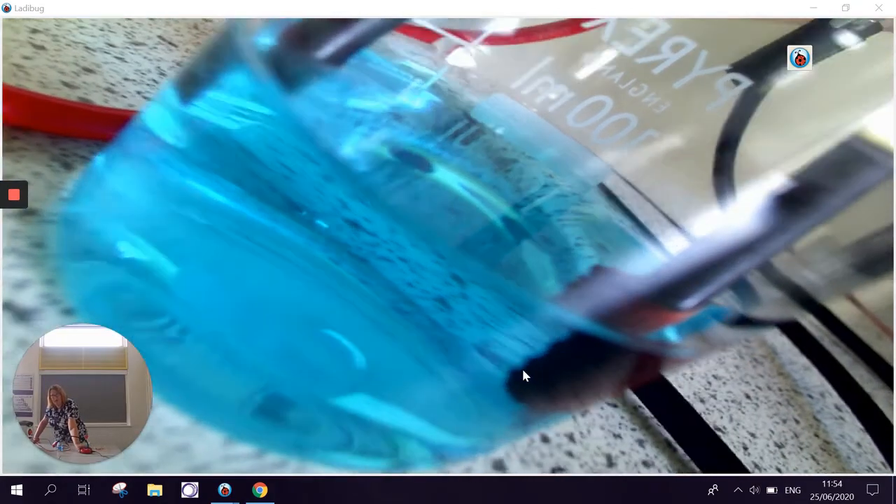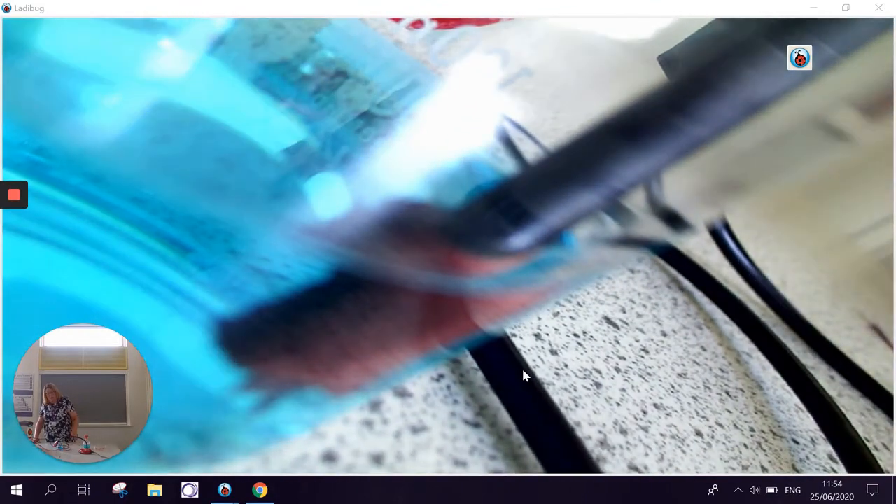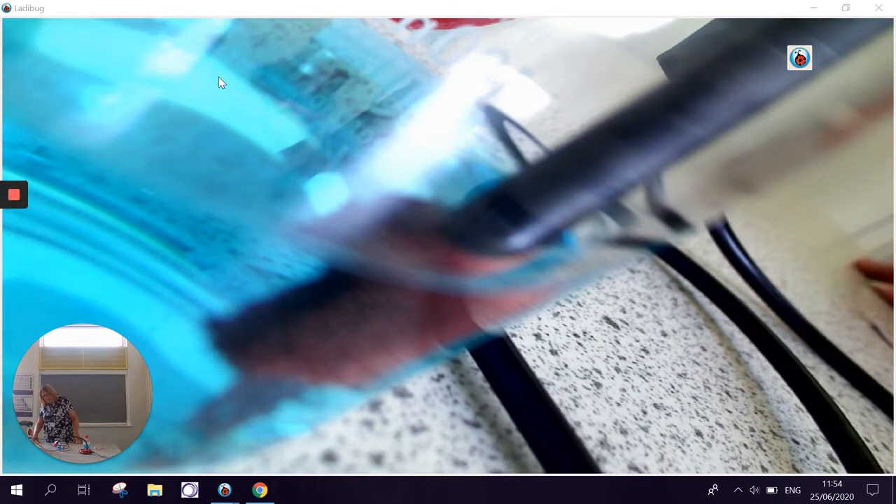Moving the visualiser over a little bit, you can see the second electrode, and from being a shiny black substance you should now be able to see an orangey-red metal starting to form on the end of that electrode. That is pure copper forming there. The copper ions are positively charged so they are attracted to the negative electrode, where they pick up electrons and form copper atoms, coating that electrode. So that's electrolysis splitting up a simple ionic compound to form two separate substances: chlorine gas and copper metal.